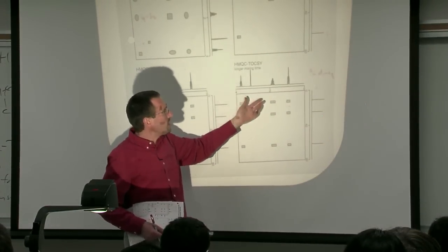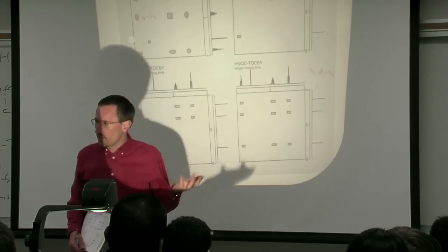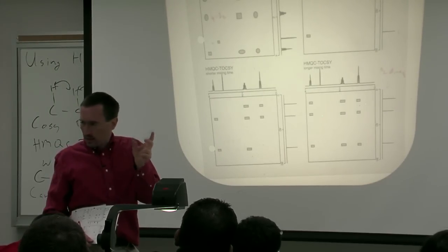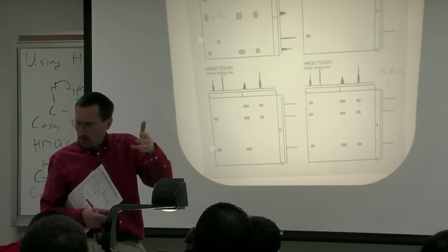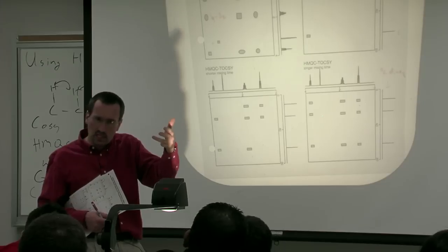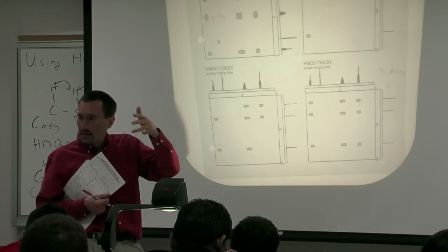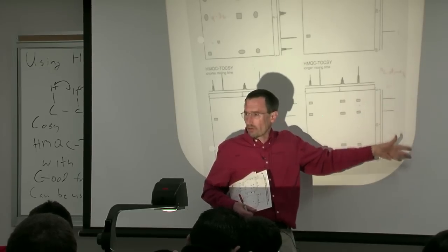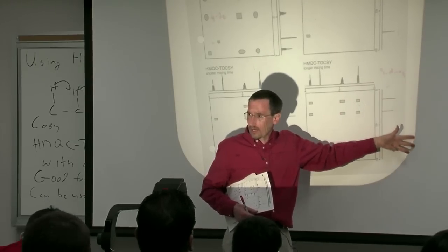In other words, in your proton dimension, sure, you've got a lot of digital resolution, but your peaks are multiplets. And as we saw in the proton spectrum, those multiplets often overlap. Very often in the carbon spectrum, your singlets are going to be all or mostly dispersed enough that they don't overlap. And your HMQC and HMBC techniques are going to be sharp enough to resolve all or most of them. And ditto, when we have the HMQC-TOCSY technique, we're going to be able to get a lot more resolution in the F1 dimension, in the indirect dimension.